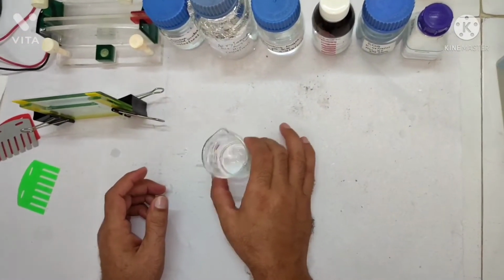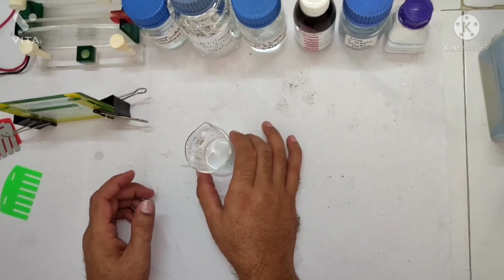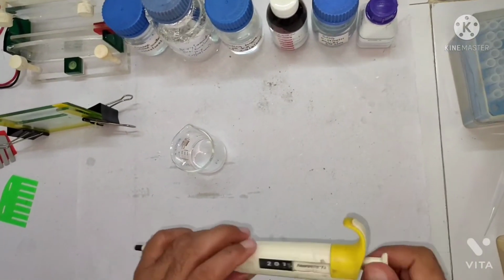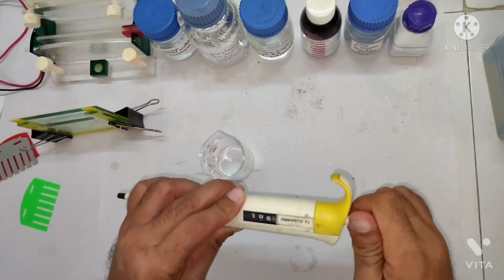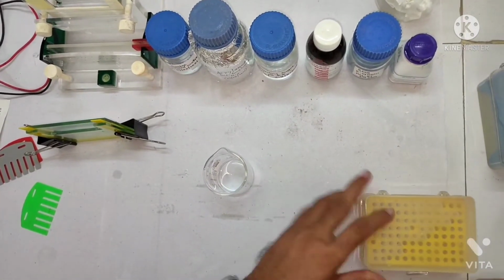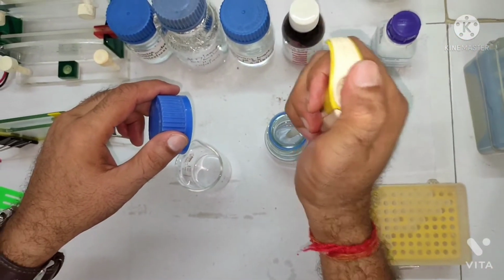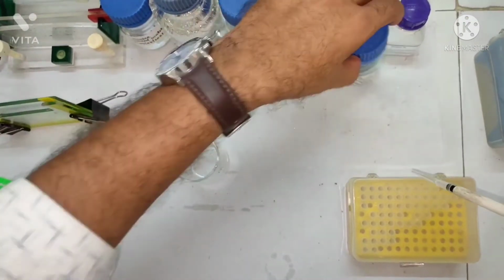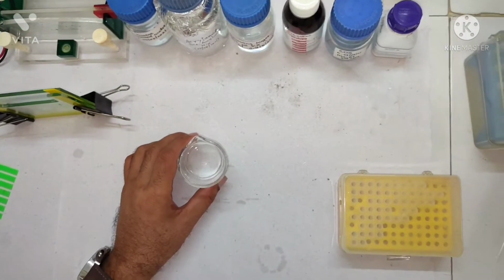Keep it properly. And then another chemical, because we are preparing the SDS-PAGE, so another chemical is SDS, and here we have to mix 100 microliter of 10% SDS, right? So I'm mixing 100 microliter. Okay, no problem. We set this at 100 microliter. This is 10% SDS. This is already prepared. So 100 microliter we have to add. So added, and then you mix it properly.